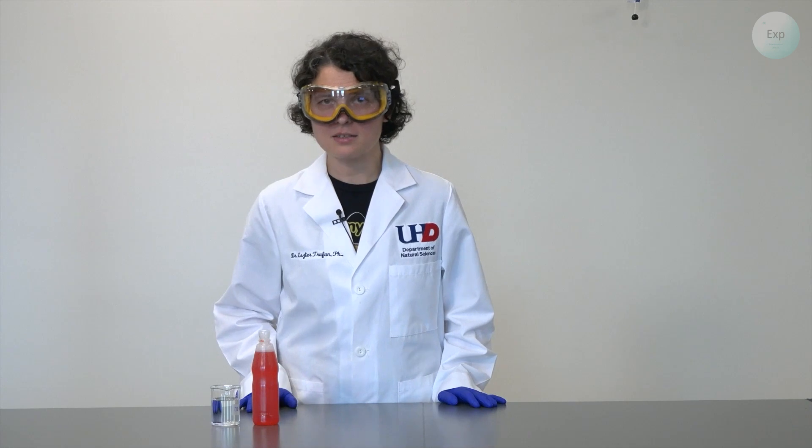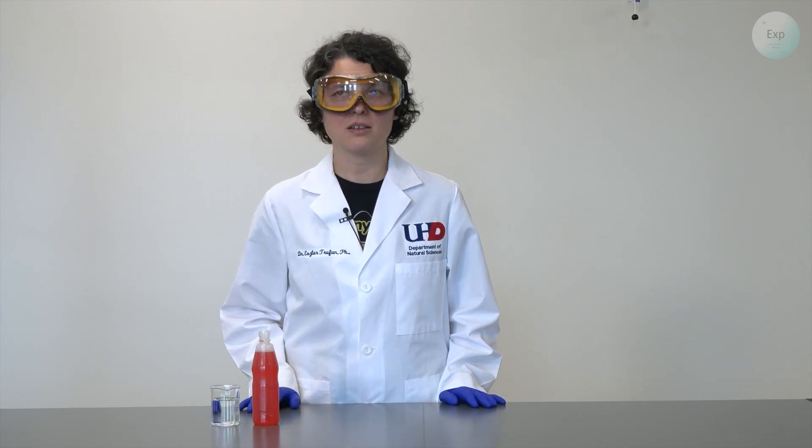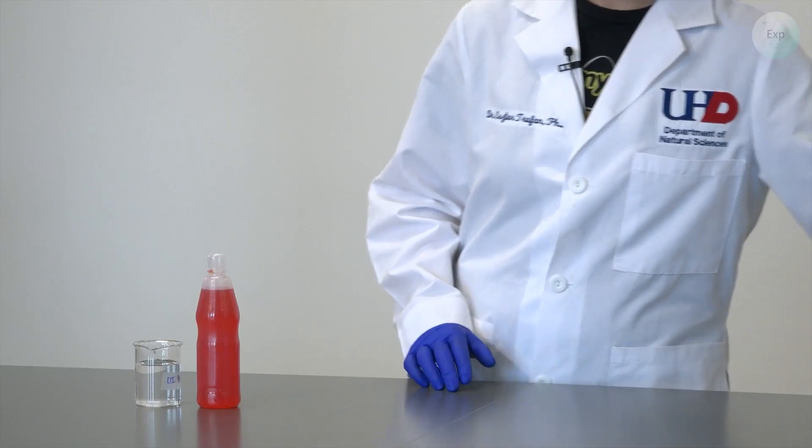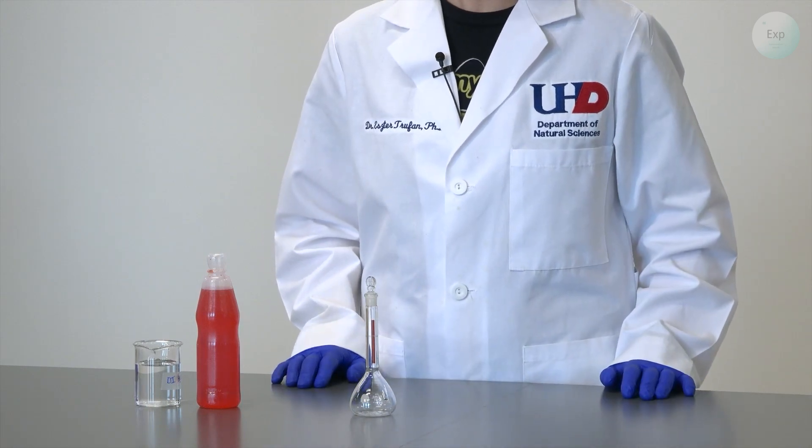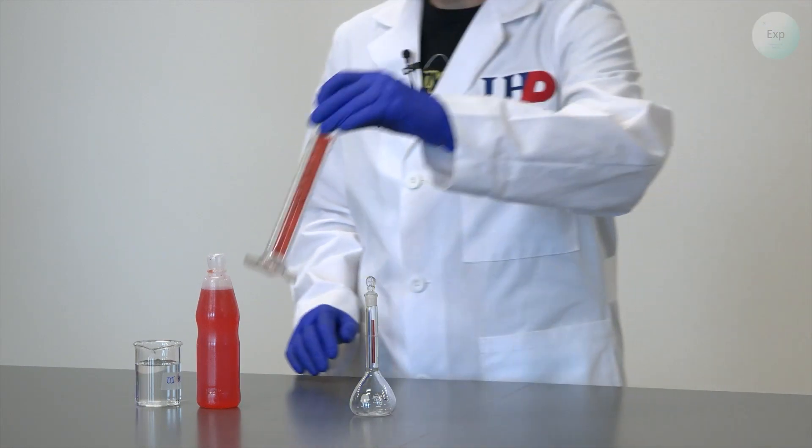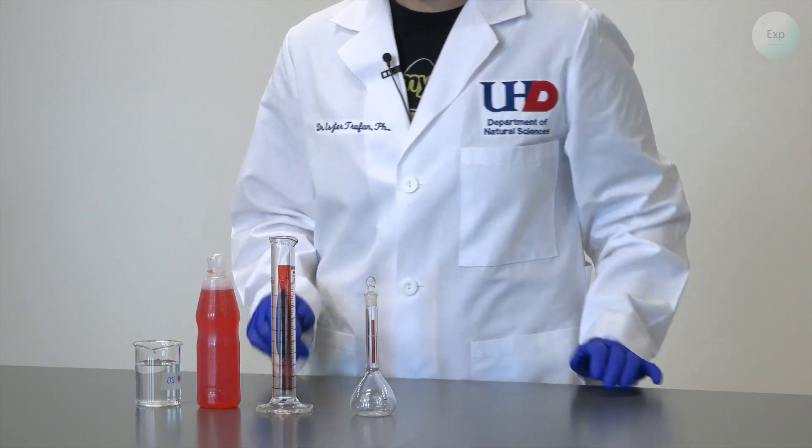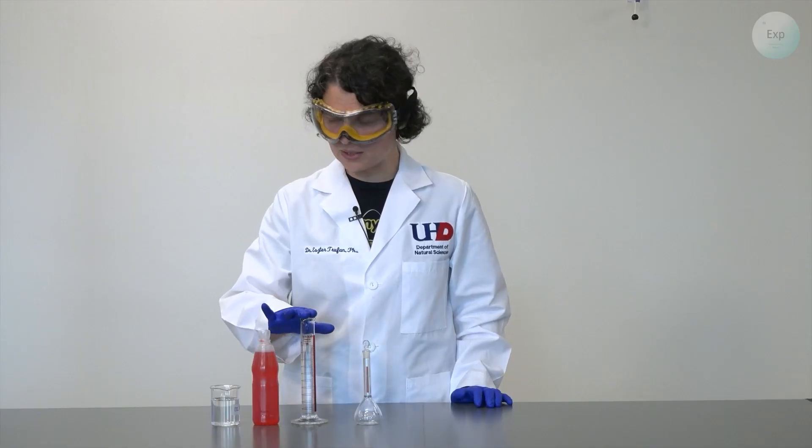We'll also need some deionized water to dilute it a little bit. Because we're making a solution we're going to need a volumetric flask and to know the original volume of juice that we're using we'll need a graduated cylinder.